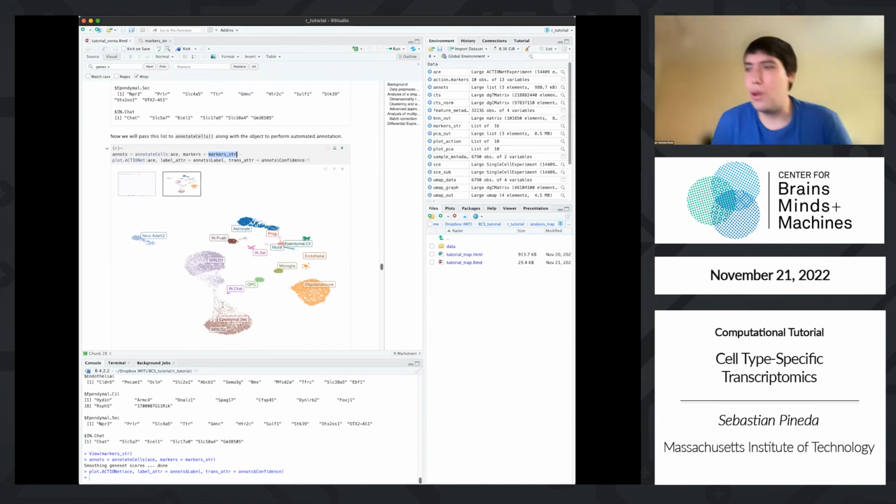And what's nice, because we know we have that network that tells us how similar cells are, we can use that to correct labels if we have cells that are contaminated. So we can run, for example, a label propagation algorithm on our data and say, okay, here are the original labels. Here are the confidences of the labels. Correct the labels. So if you have in this cluster of oligodendrocytes a point there labeled astrocyte, it says, okay, well, this point is labeled astrocyte because it's enriched for these astrocyte markers relative to the cells around it. But the 20 cells nearest to me are all oligodendrocyte. I'm probably an oligodendrocyte as well. So it also permits this sort of error correction mechanism.